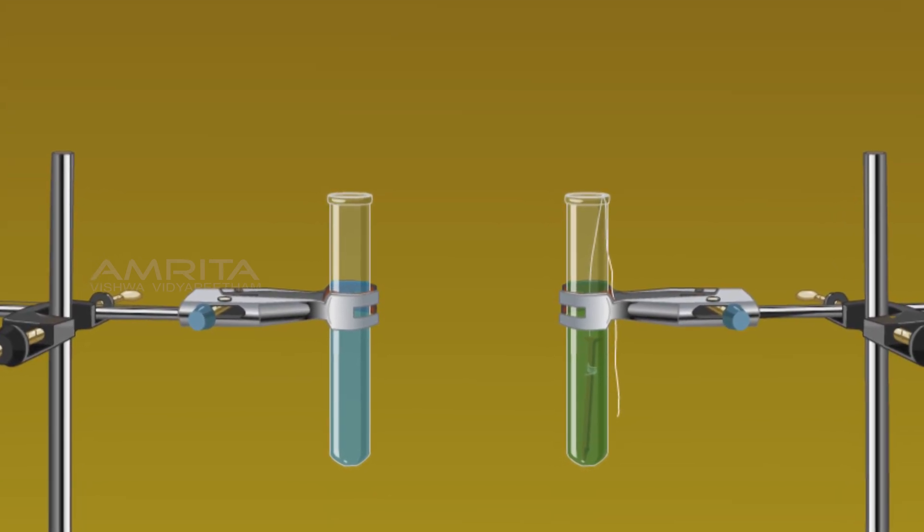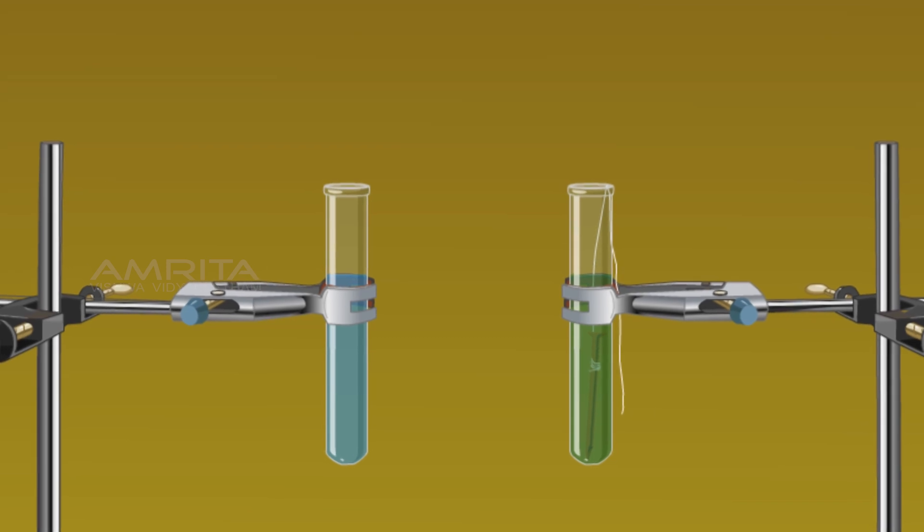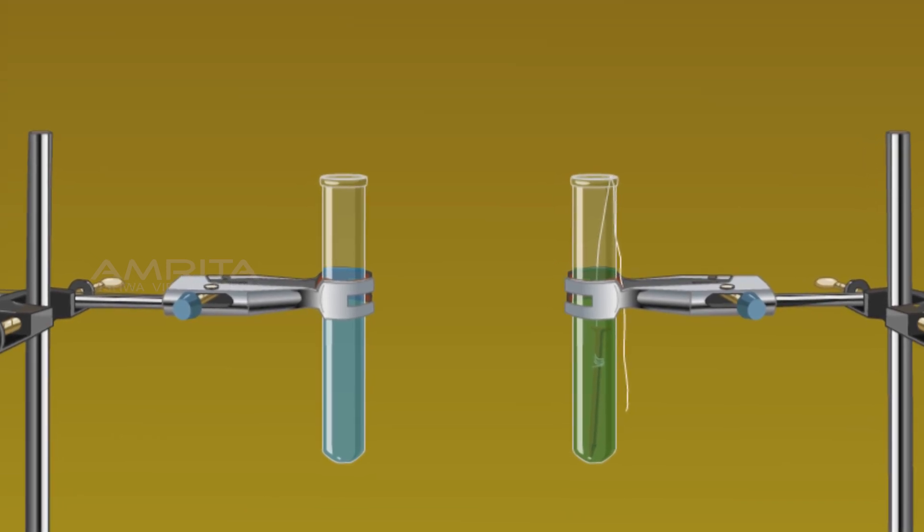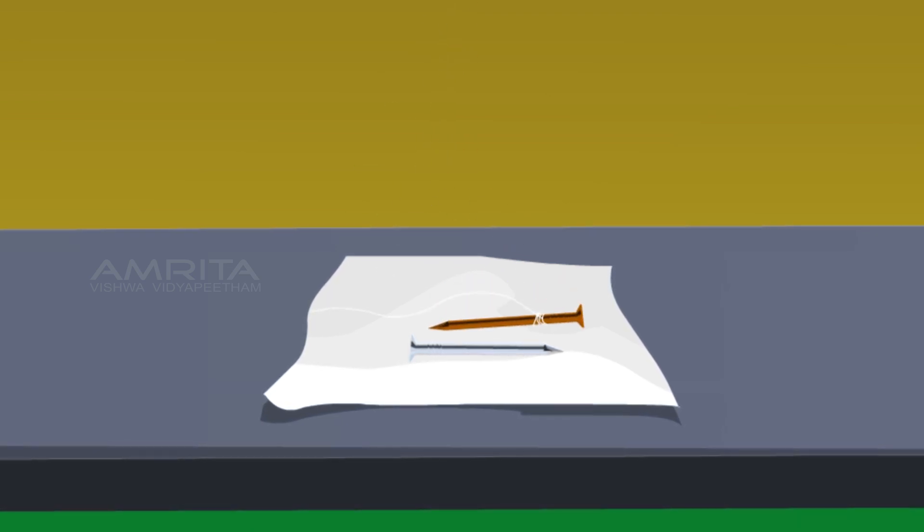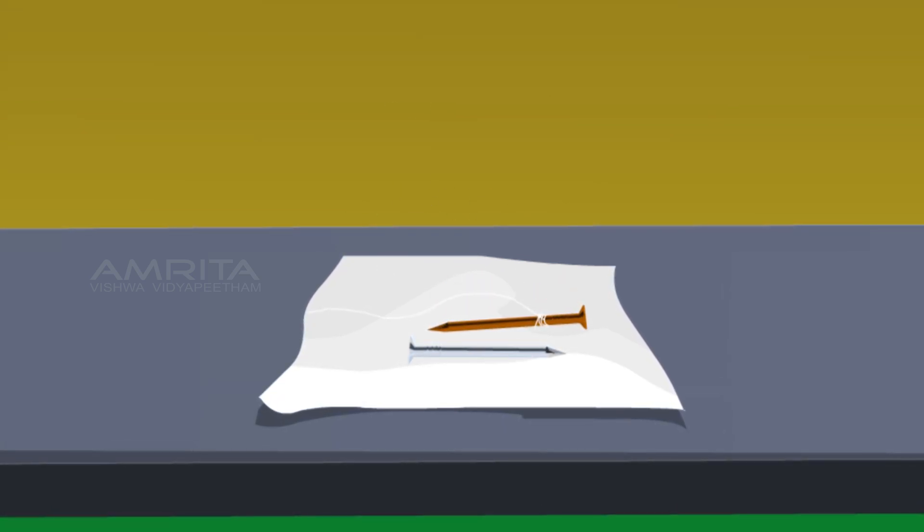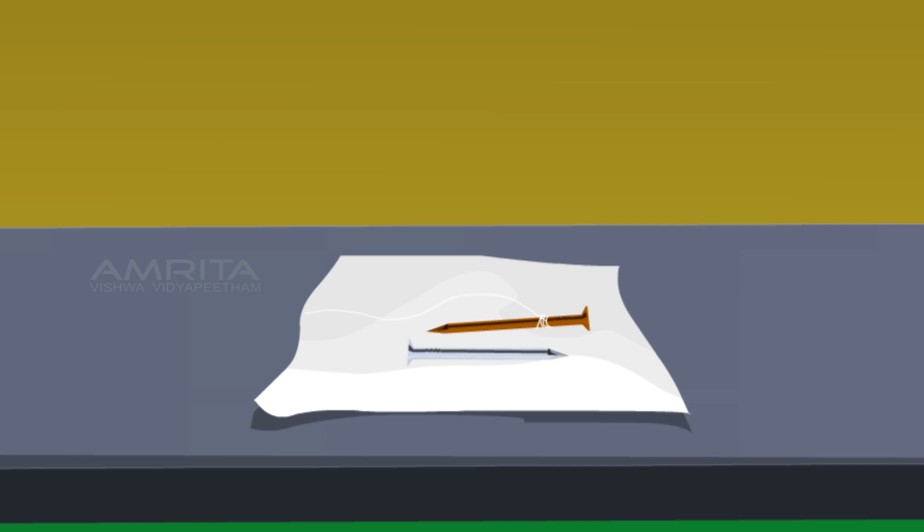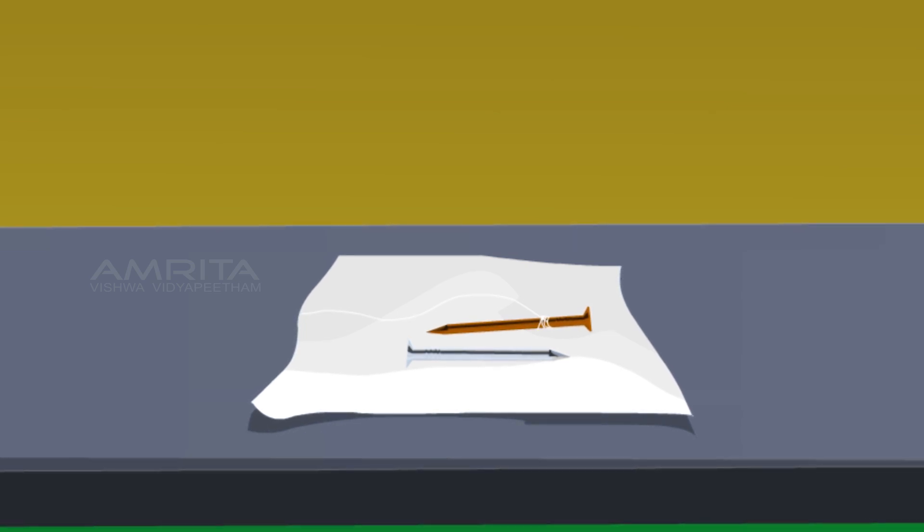The greenish colour of the solution is due to the presence of Fe2+ ions. Remove the iron nail from the solution. Compare it with the other nail. There is a brown coating of copper on the nail that was dipped in the copper sulphate solution.